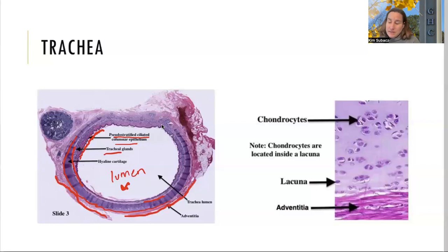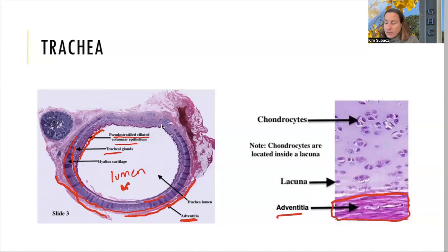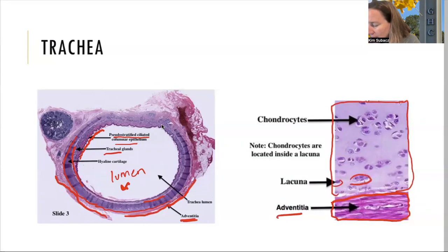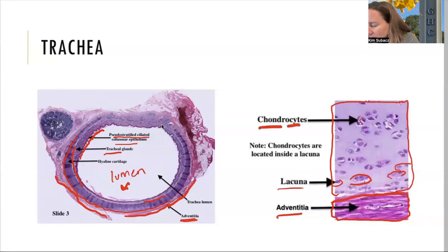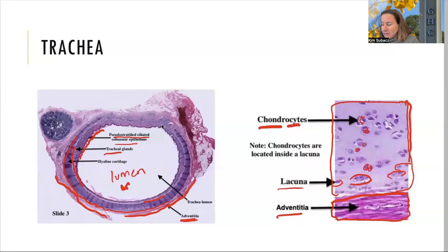On the outside, all of this stuff is adventitia — the connective tissue that holds the trachea in place. Zooming in, starting from the outside going in: here's our adventitia, the connective tissue on the outside. Then if we zoom in on those cartilaginous rings, all of this is cartilage — and we know it's cartilage because of the lacunae. Every single one of these little guys are lacunae, and they are going to be filled with the cells that make that substance. If it's cartilage, they are filled with cells called chondrocytes. Each one of these little chondrocytes is in here — the little nucleus gives it away that there's a cell inside — and they are releasing the chondroitin and all the substance around it to build up the cartilage.